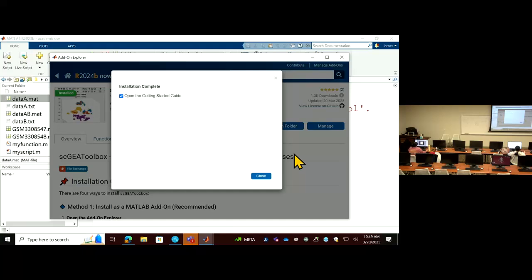Even though you may not have a clean deletion, you should still be able to install the add-on. So you still try to delete the file. Yes, but it's okay if you cannot delete it. Just keep it, and add the add-on.